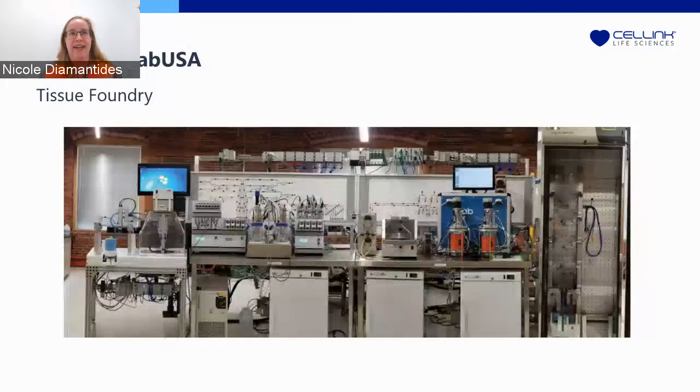And I do want to highlight ARMI, the Advanced Regenerative Manufacturing Institute. They're in New Hampshire. Their whole goal is to answer the questions I've been talking about today. And they've created the tissue foundry, which is basically them starting to create an assembly line process. What would this look like on an assembly line to create a tissue engineered product? So if you have interest in this area, I highly recommend checking it out.